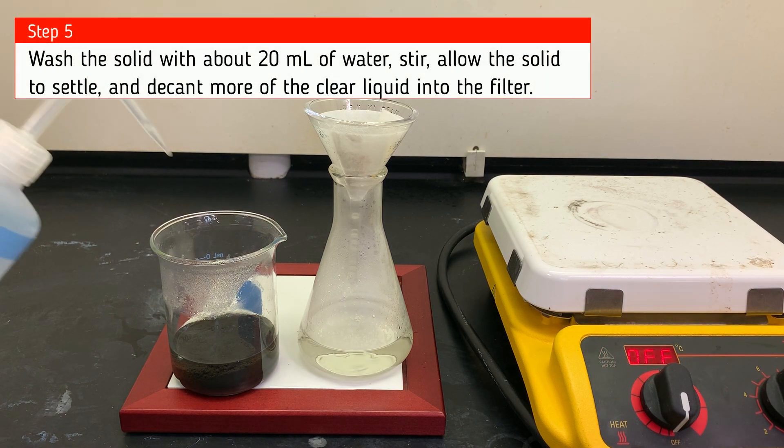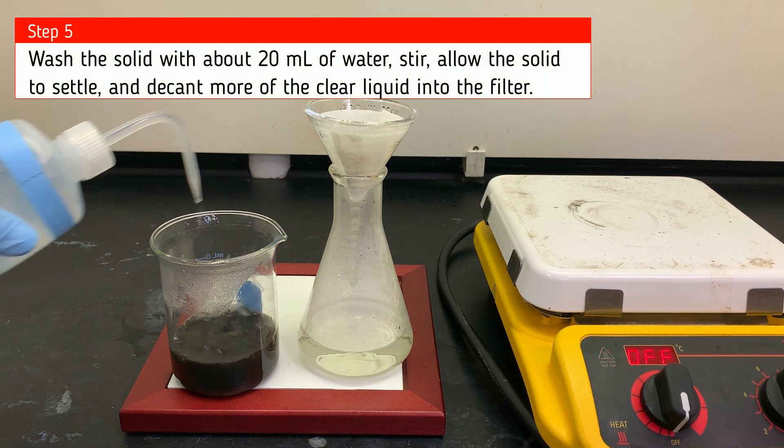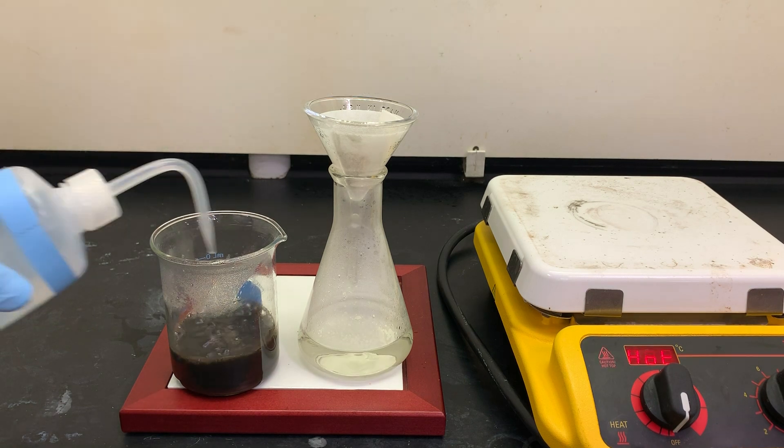Now we're going to take some distilled water and rinse that precipitate. We'll allow the mixture to settle and then decant it again.